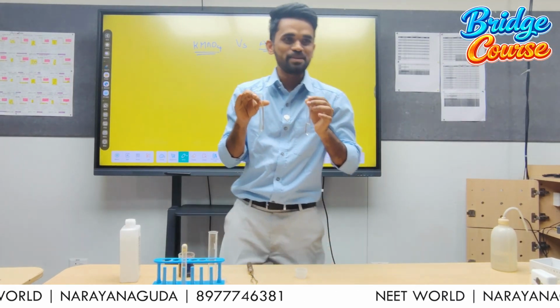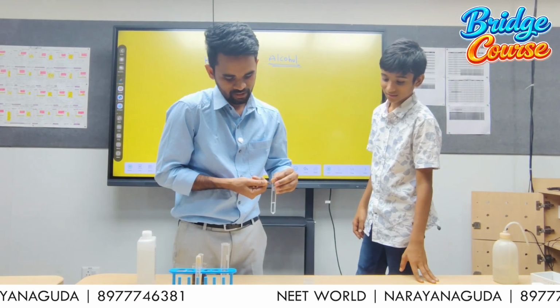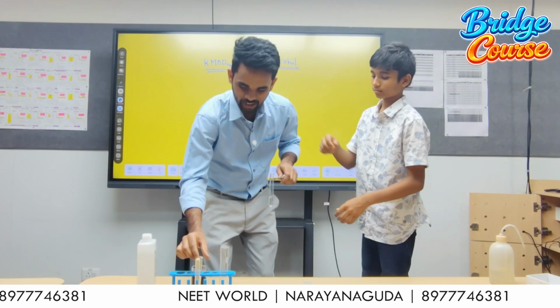Come Harish, help me out. Yes. Okay, you can see.